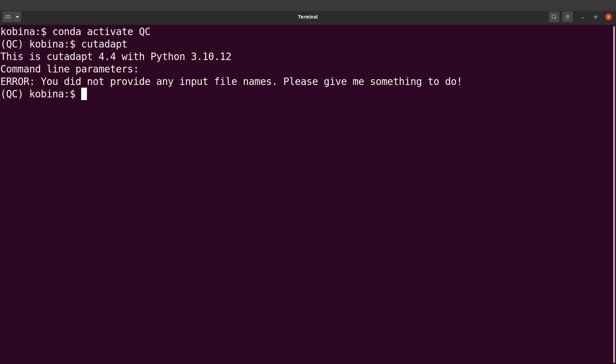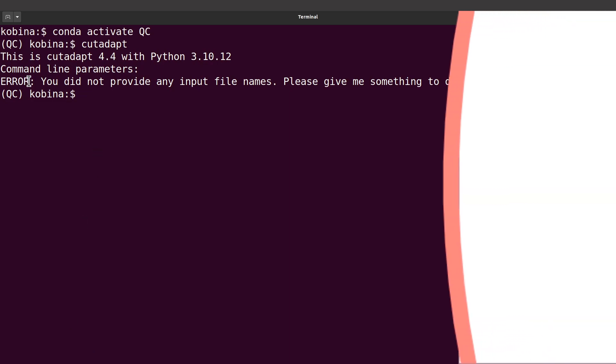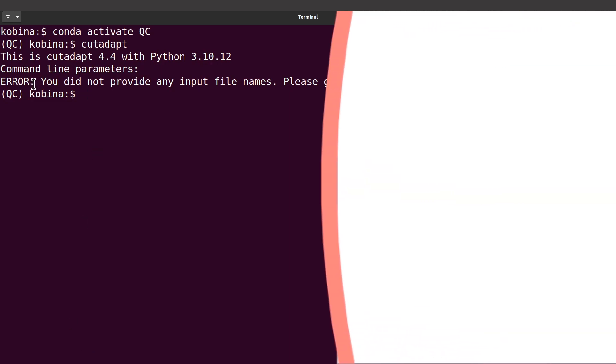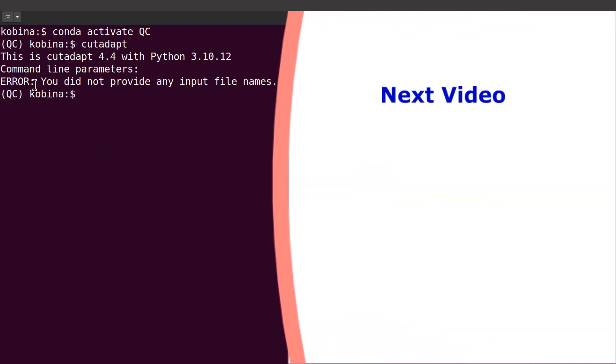You get something like this coming up. Of course there's an error message because we didn't specify any inputs or any options, so this is fine. That's what we need.